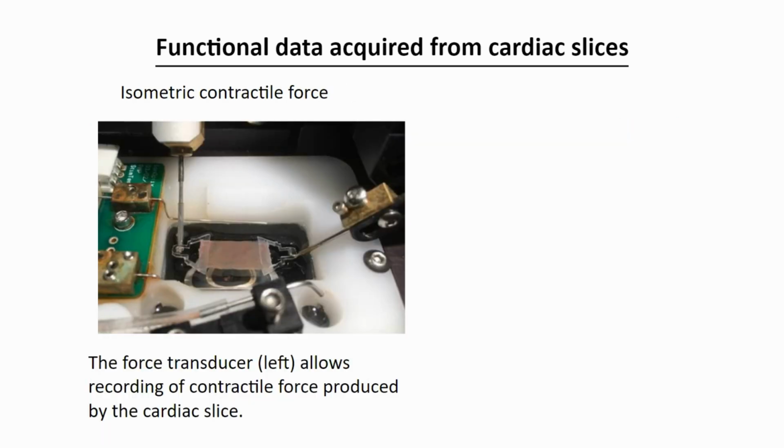We can also record contractile force dynamics of the cardiac slice using a force transducer. In this image, the force transducer is holding the hook that's on the left side of the cardiac slice.